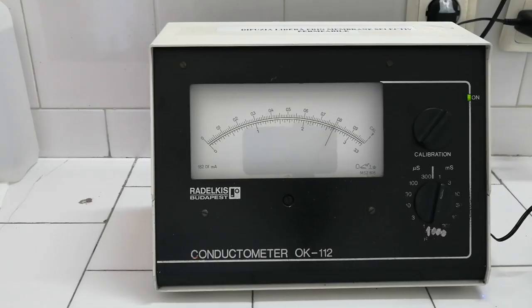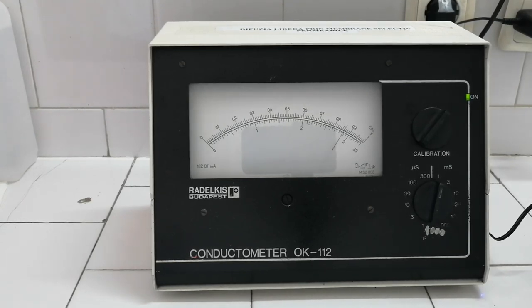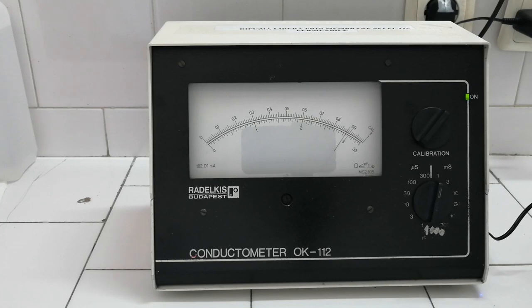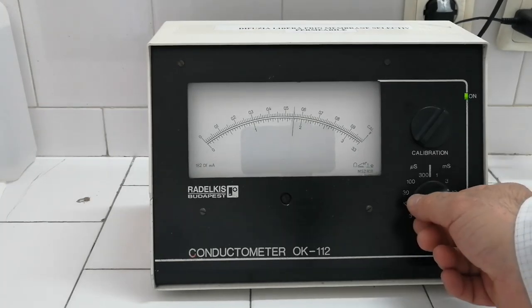Attention! As the electrical conductance of the solution in the internal container continuously increases, at some points you'll have to change the conductometer's measurement range in order to be able to read the correct values.